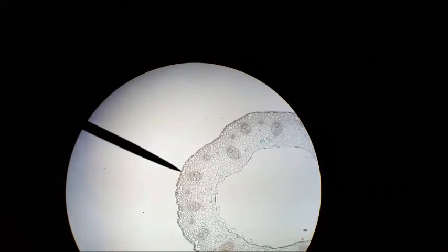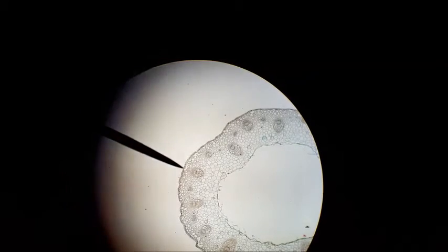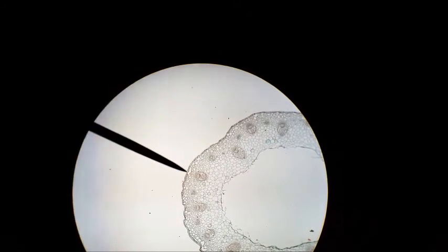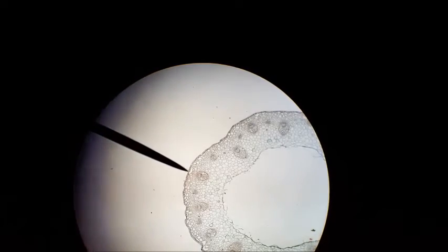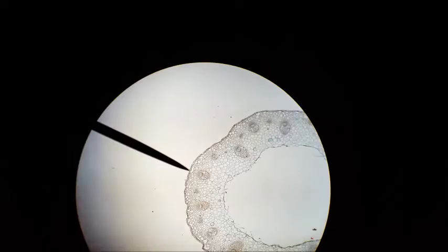This is 40x magnification of an alfalfa stem dicot. The pointer is on the epidermis. I'm going to move the pointer more internally and try to place it on important features.